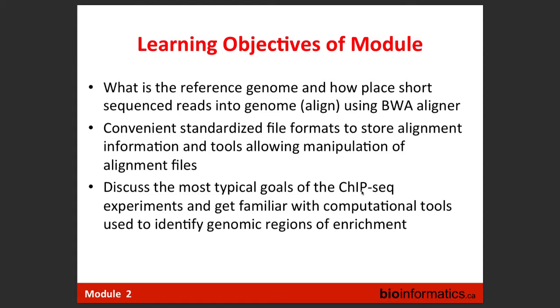We will also try to discuss what enrichment actually is, how we define it. Because it's actually goal specific, question specific, and it's not easy. It sounds like a very natural and easy thing, what is enriched, but if you stop for a second and think what it is, it's not that.